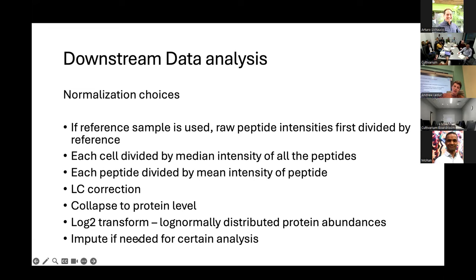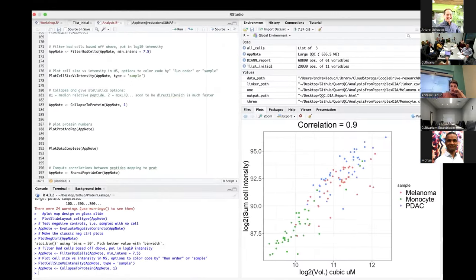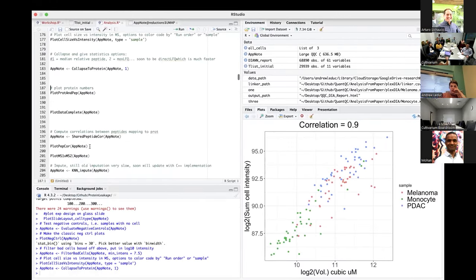And then if you want, we have an imputation step that's optional. You can do PCA without the imputation. You also could do a UMAP without imputation if you're computing your covariance matrices pairwise, so only for the values that are in common between two single cells. But we have a KNN impute function. So you can run all these things.